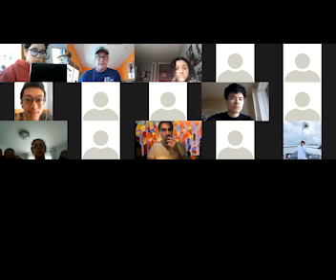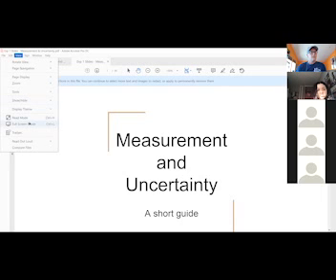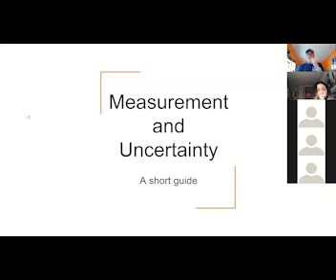Let me get into what we are going to be dealing with today. Here we go. So we're just going to be learning about doing measurement and how to report and deal with uncertainty.